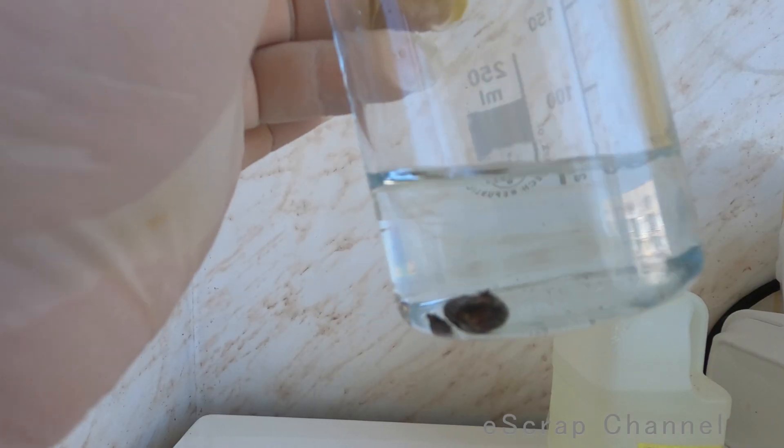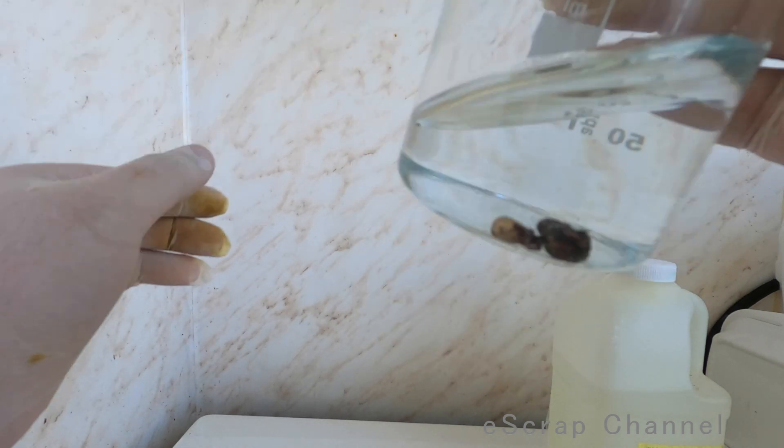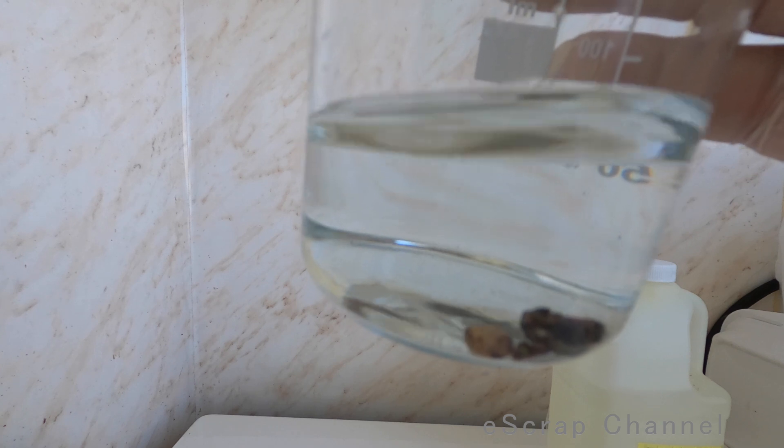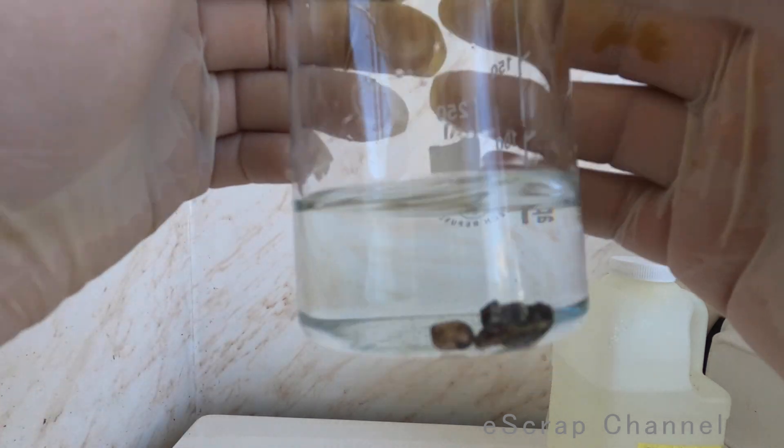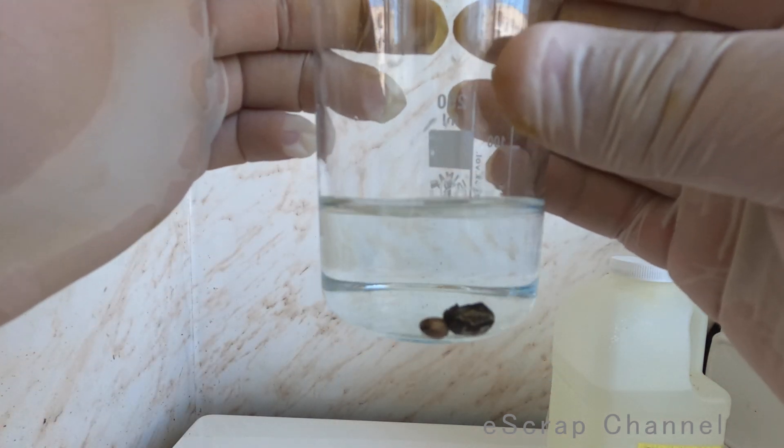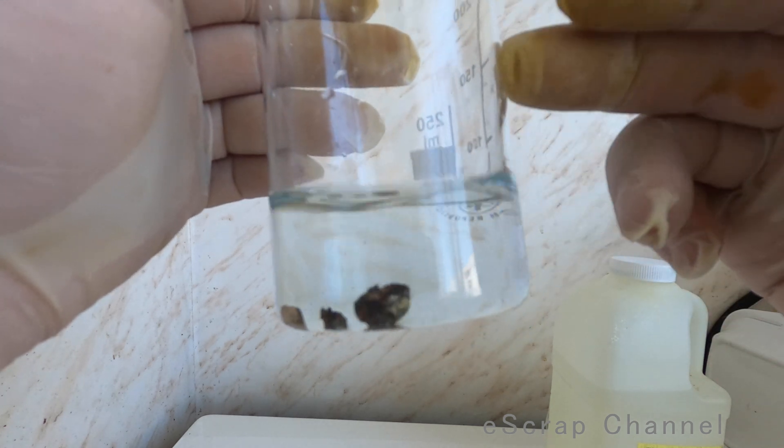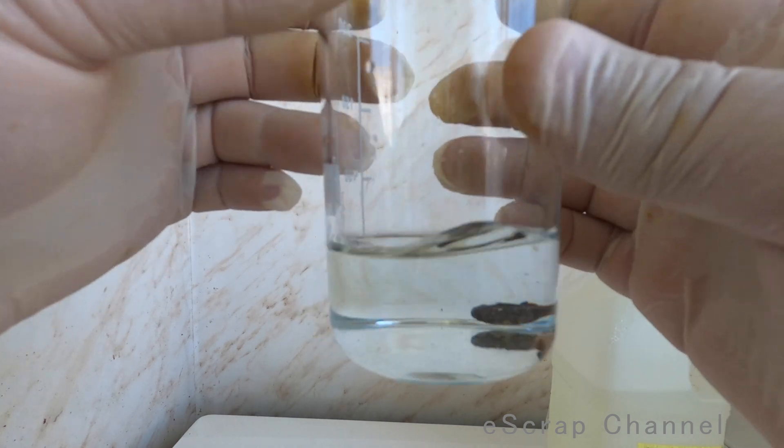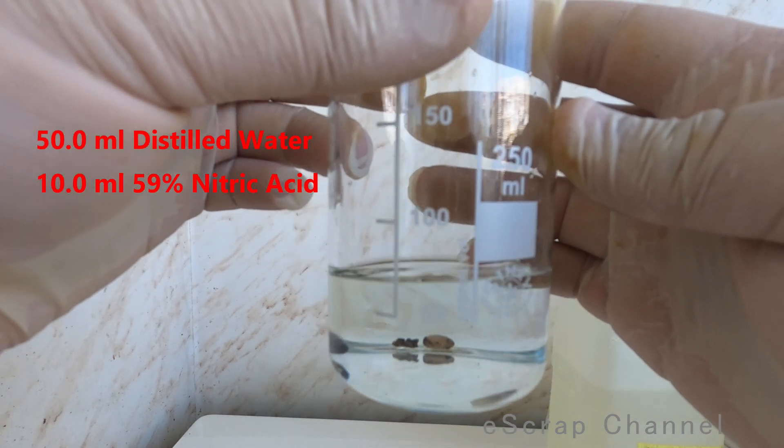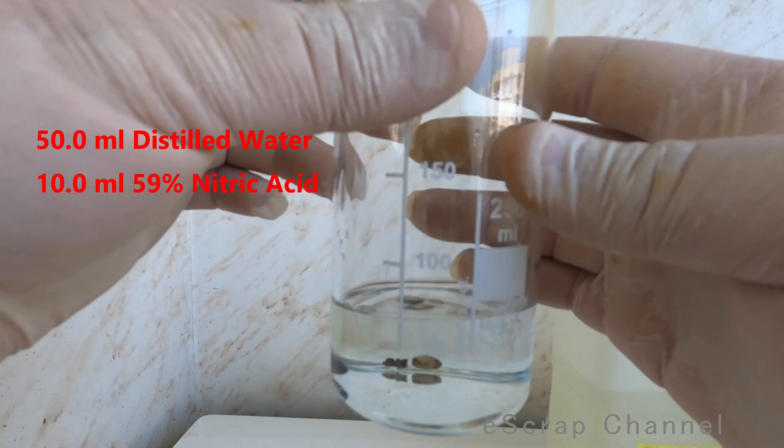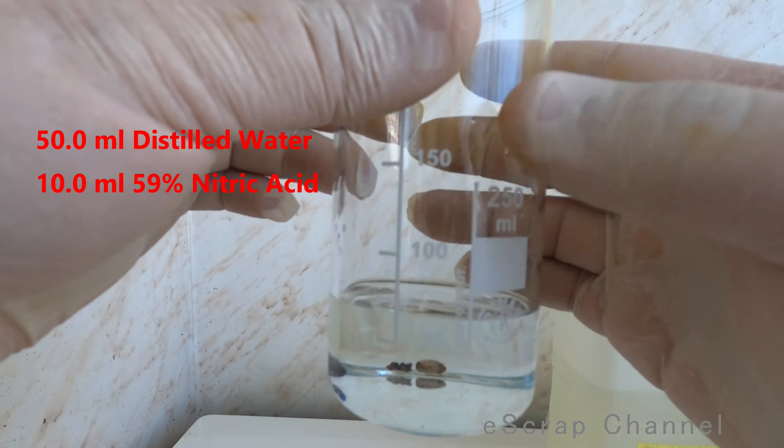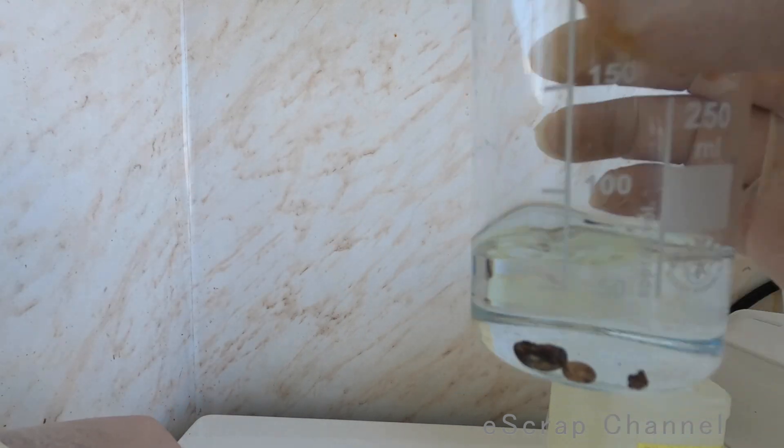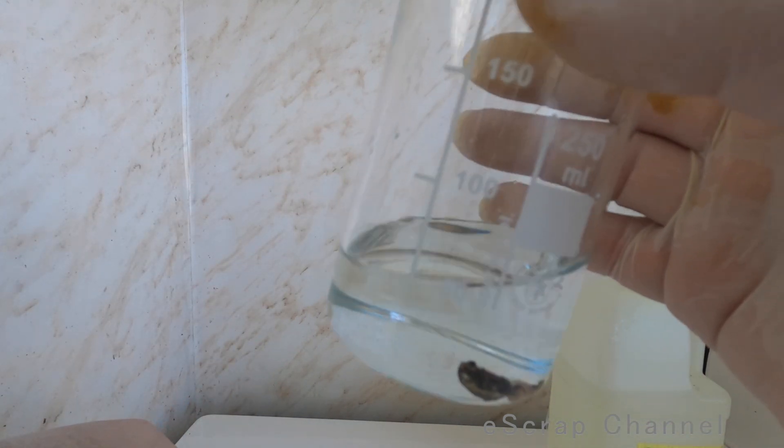So the first step will be to check if there is any base metal and if there is any to dissolve it. I put distilled water, about 50 milliliters distilled water and about 10 milliliters 59% nitric acid.